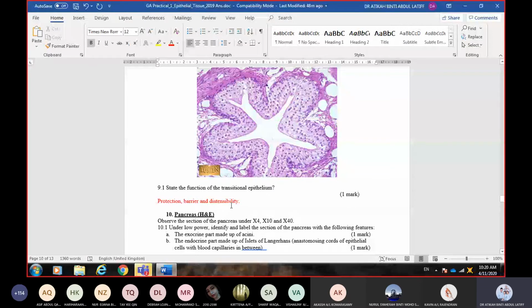Okay, so next is the pancreas. I'll just bring this down.